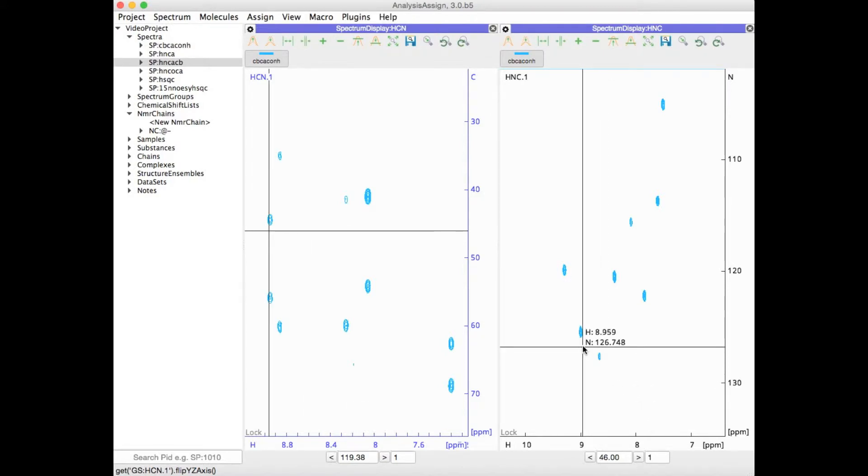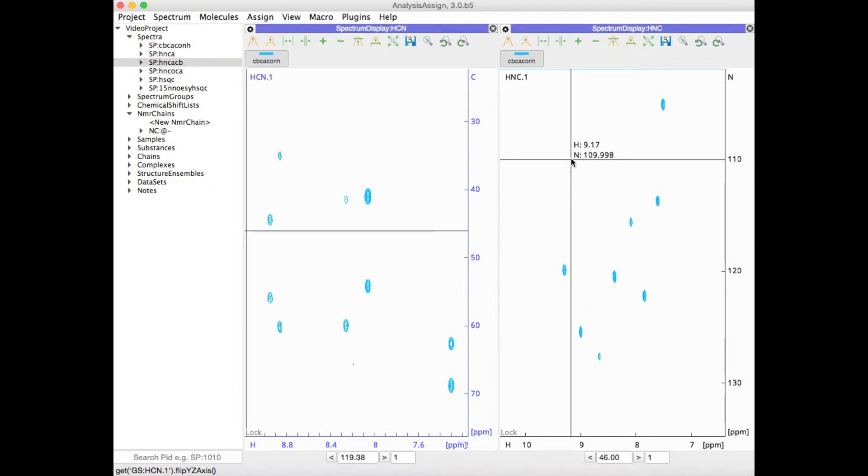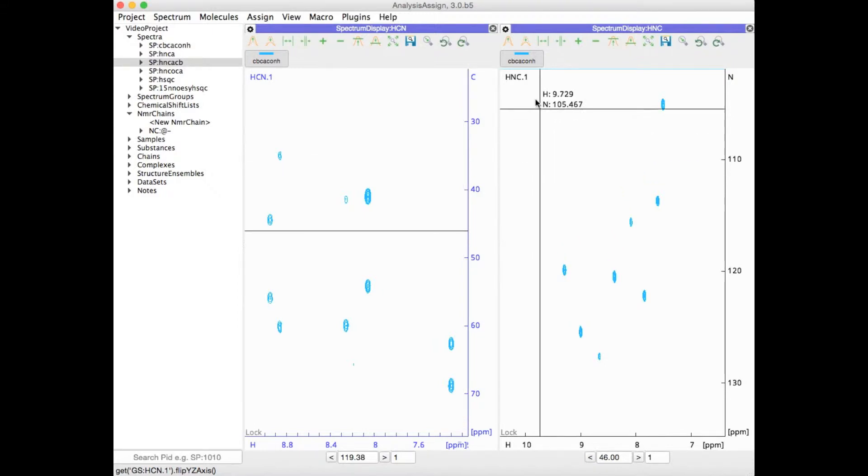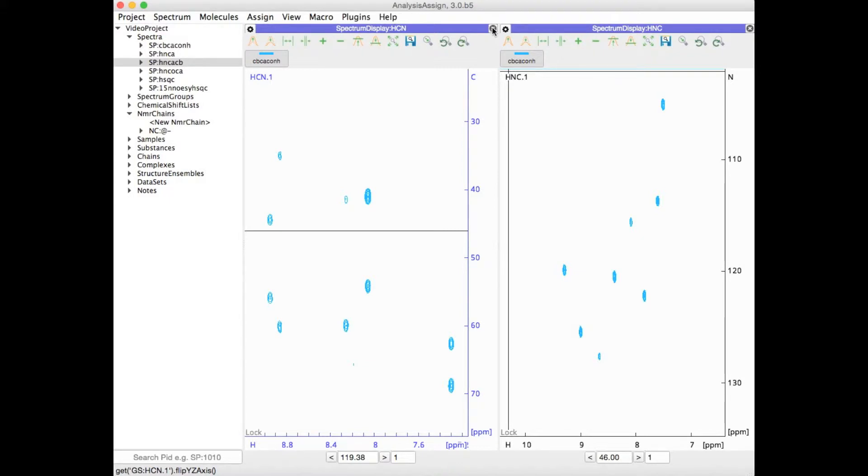As you can see, it is in a separate module. That's because in Analysis version 3, each module is always associated with one particular type of axis arrangement. Once you've flipped your spectrum, you can decide whether to close the old module or retain it.